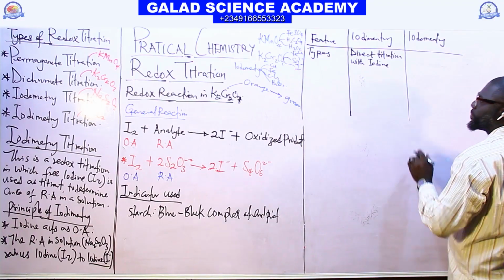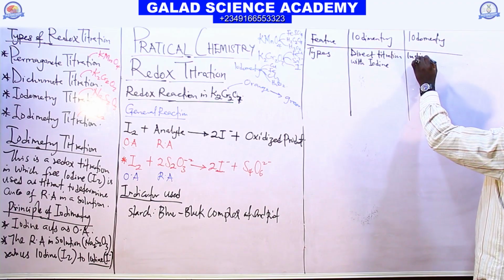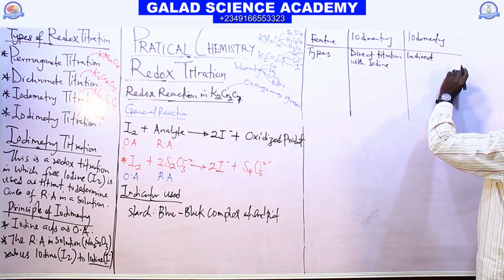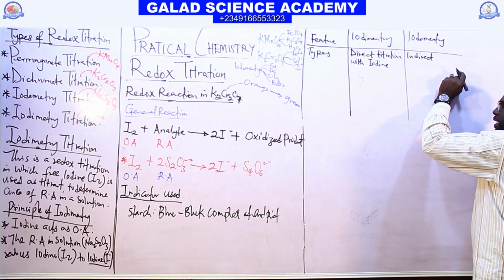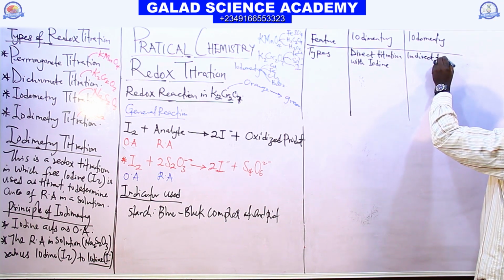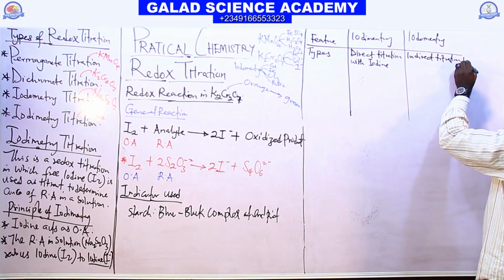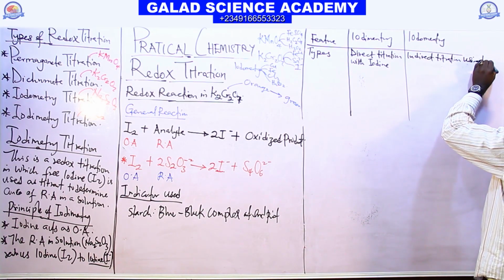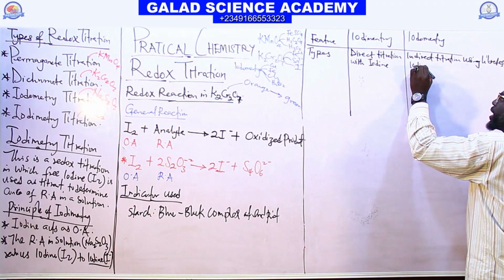But here iodometry is indirect titration, using liberated iodine.